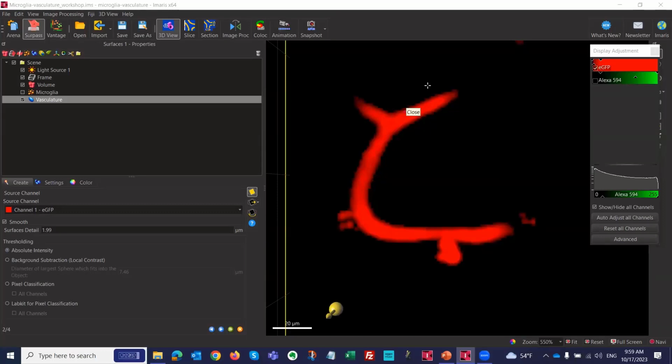I don't know. We don't know. It's part of the brain, but I don't know too much more of this data set in terms of whether it's a co-culture and whatnot. But it's definitely a deep stack here. I think it's really imaging deep into the tissue, and we get a few microglia here.